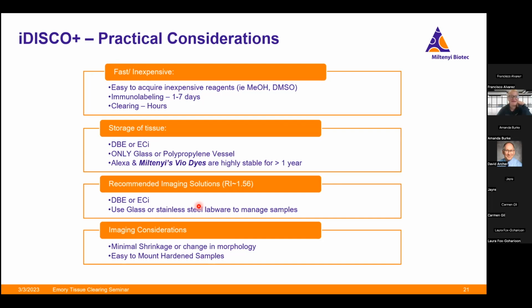Okay. Yes. And to that point as well, just from personal experience, ECI will also disrupt the finish on lab benchtops. It is a cosmetic thing, but what I like to tell people to do is if they're working on their lab bench or even in the fume hood, use these, I call them blue diapers, but these lab pads.